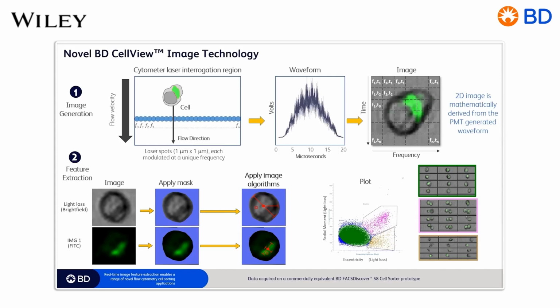Through an orthogonal acoustic wave pattern, the AOD takes the laser beam and breaks it up into what we call beamlets. These beamlets are approximately 1 micron apart. Through some other interference optics, we impart a frequency signature on each one of those beamlets. If you were looking at the laser beam from the left to the right in this figure, each part of the laser has a signature vibrational frequency, and we vary that frequency by an incremental amount as you go across the laser beam.